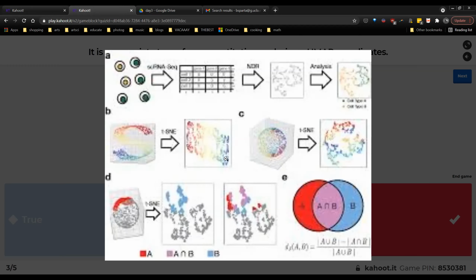But when we quantify distortion, we can do so by calculating the neighbors in the high dimensional space, like the 20 nearest neighbors of cells, and then the neighbors in the low dimensional space, and comparing how much this set of neighbors overlap relative to the total combined set of the neighbors. So when we look at this overlap of t-SNE versus high dimensional data, we see essentially that 98% of the neighbors are totally different.